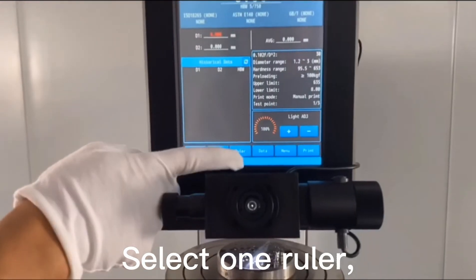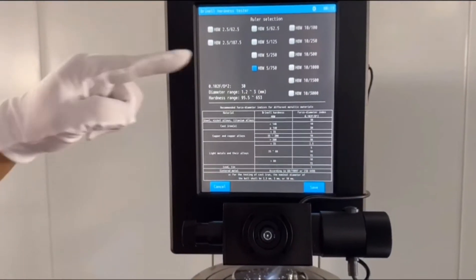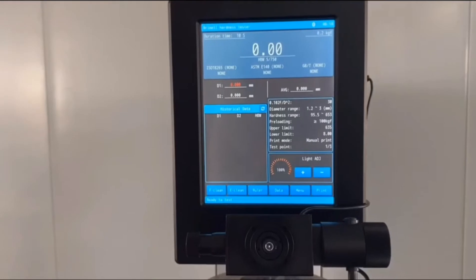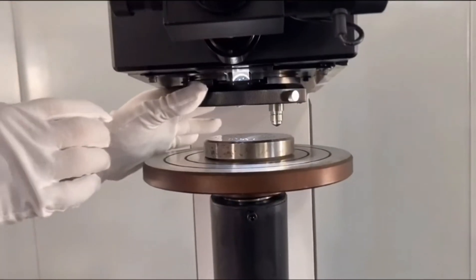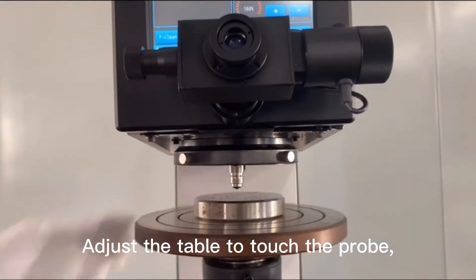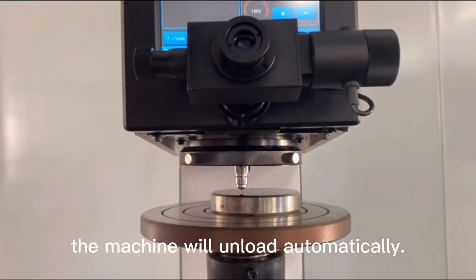Select one ruler. Rotate the turret. Adjust the table to touch the probe. When you hear a voice, the machine will unload automatically.